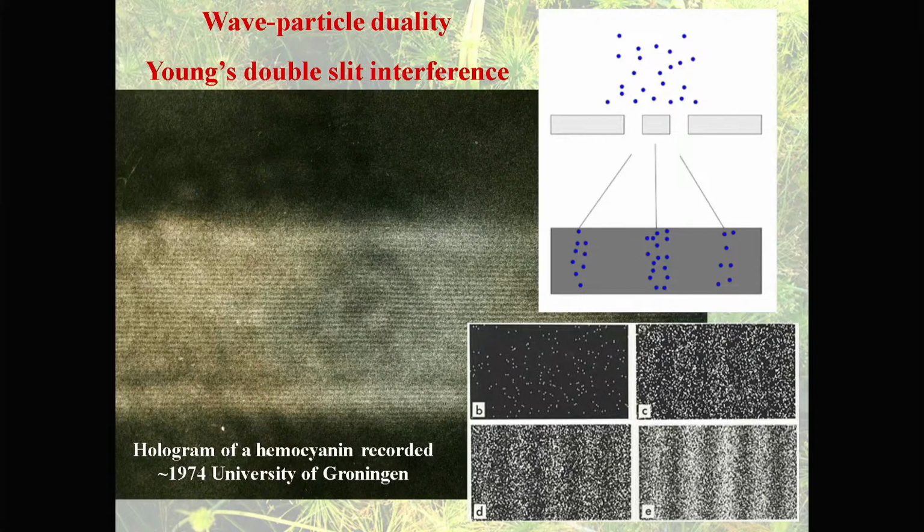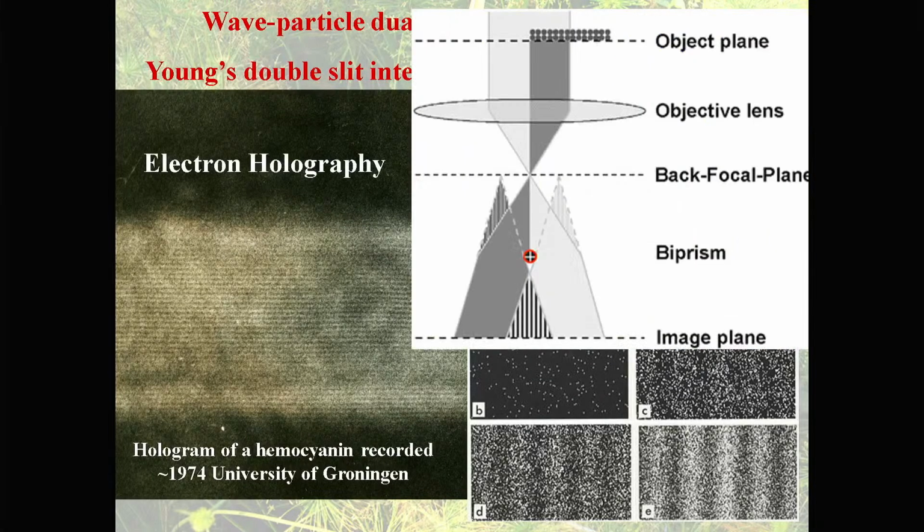It's a bit more complicated than that, in the sense that the equipment was what we call a biprism. You have to take an electron microscope and change it, and then put a little hair in there that you can charge, and the virtual sources come from two different points, and they interfere in a certain area, and that allows you to do things that you couldn't do otherwise.